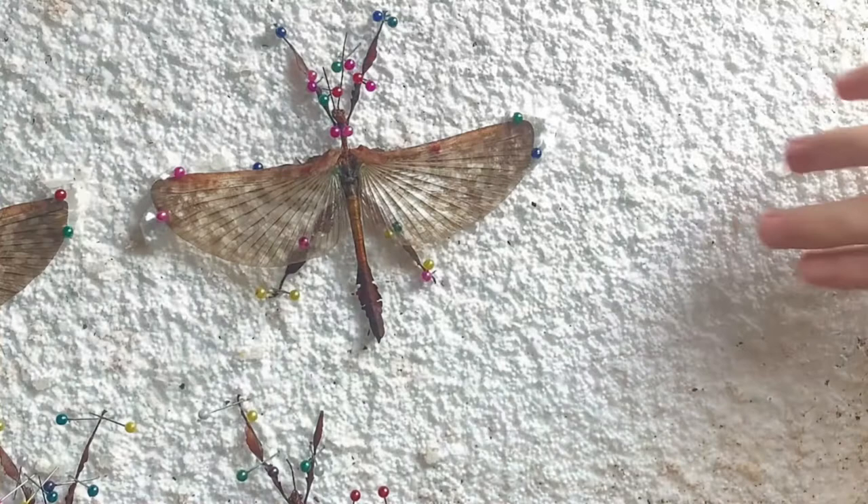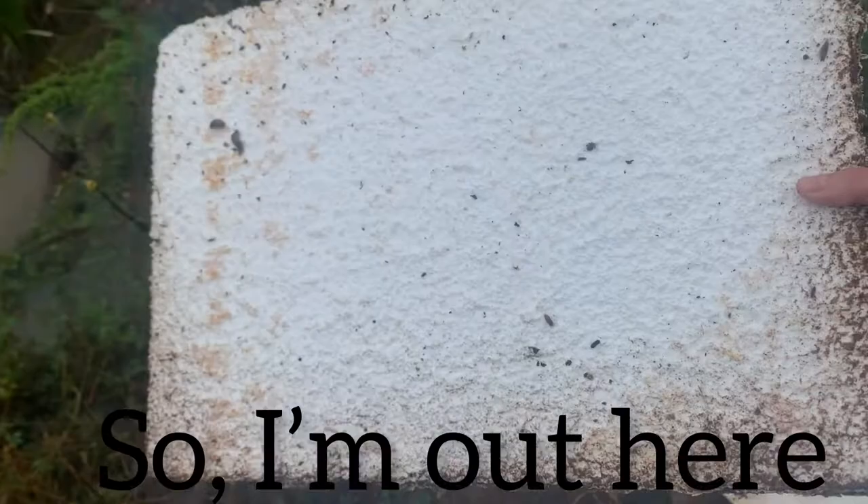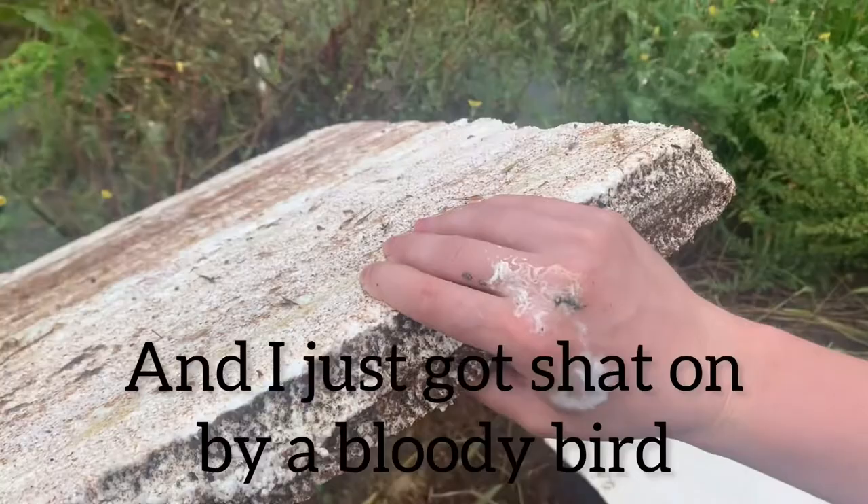The materials you will need for this guide includes a piece of styrofoam to pin the insect on. I actually found this piece of styrofoam on the side of the road and decided to recycle it — and here's what the local birds had to say about that. So I'm out here looking for a nice piece of styrofoam and I just got shat on by a bloody bird.